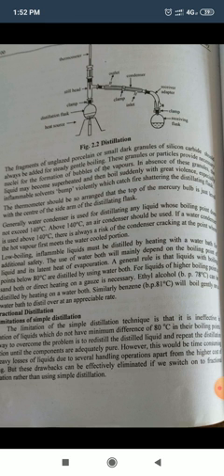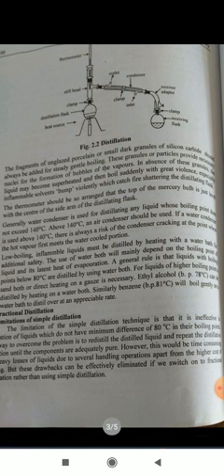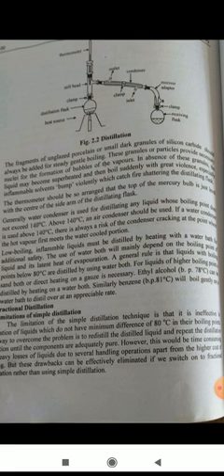For liquids of higher boiling point, a sand bath or direct heating is necessary. Ethyl alcohol, boiling point 78 degrees Celsius, can be distilled by heating on a water bath. Similarly, benzene, boiling point 81 degrees Celsius, will boil gently in a water bath to distill over at an appreciable rate. That is the simple distillation. Next is fractional distillation.